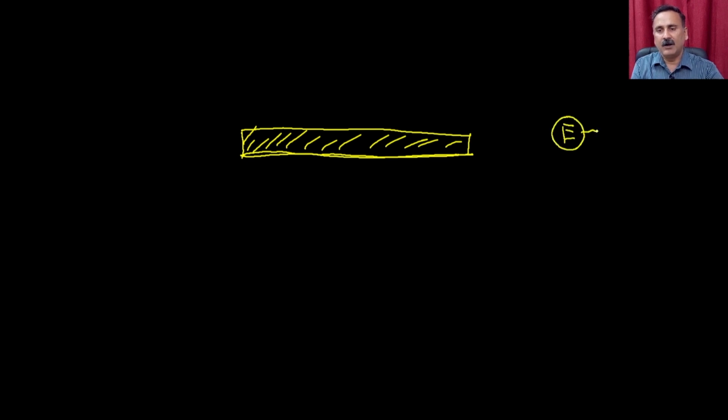The metal surface is going to be functionalized. Suppose it has an amino group. If this metal surface has an amino group, I can use it to couple the enzyme for which I want to calculate the dissociation constant. So the enzyme is going to couple to the surface on this side, right?